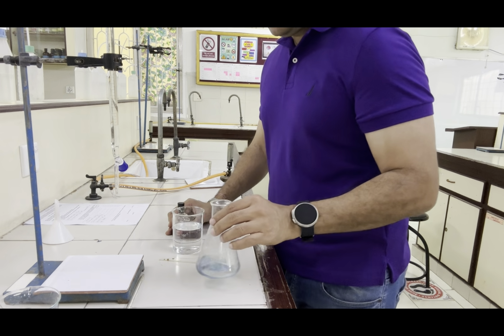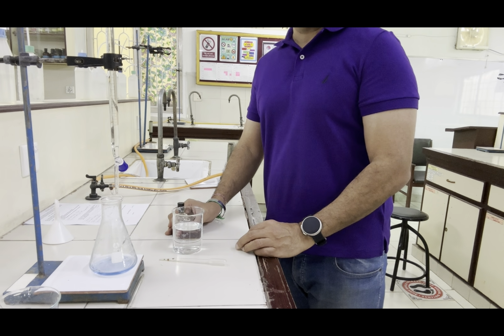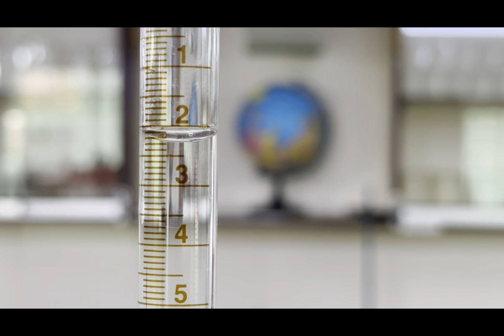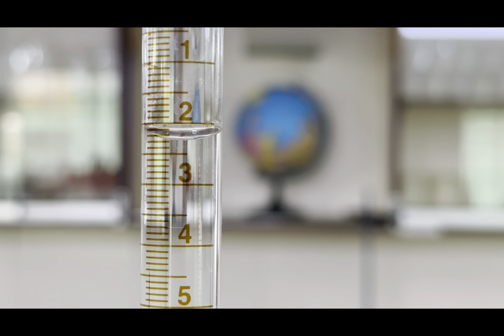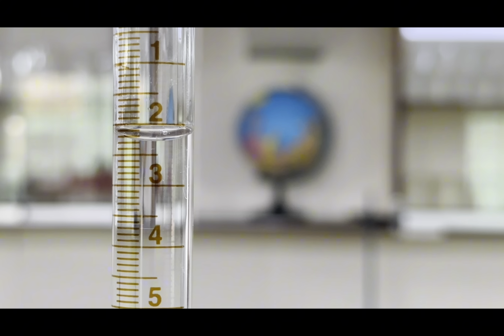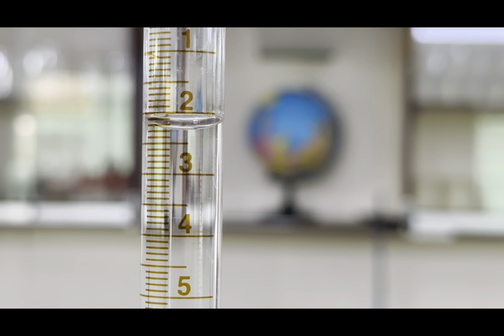Now I will start the accurate titration, but before I do, let me record the initial burette reading. The initial burette reading is 2.25. You can see the lower meniscus is in between the second and third graduation. Therefore, we will take 2.25 as the initial burette reading.